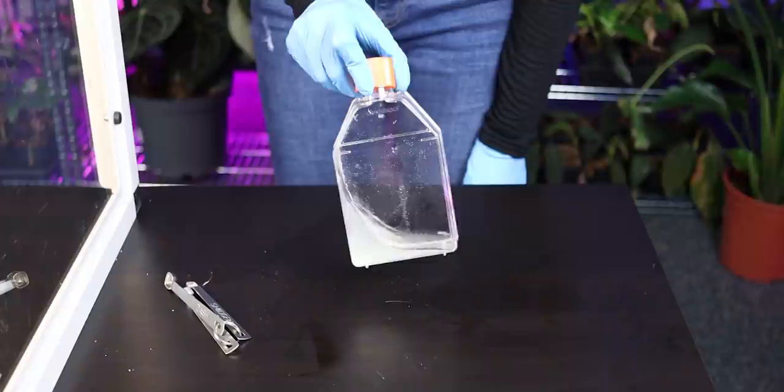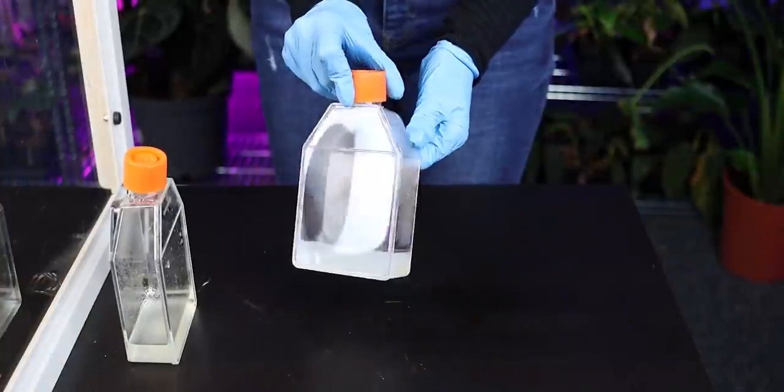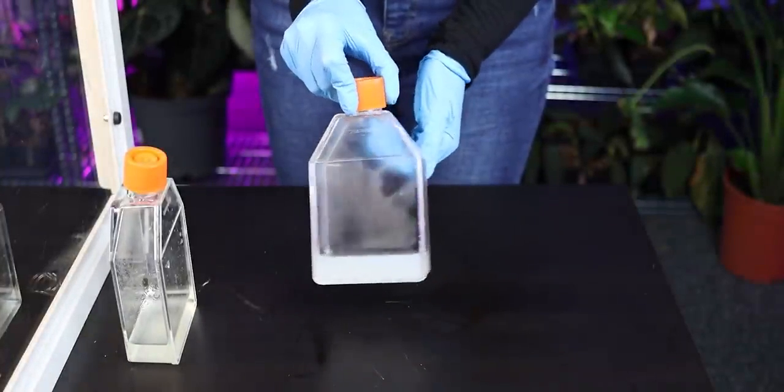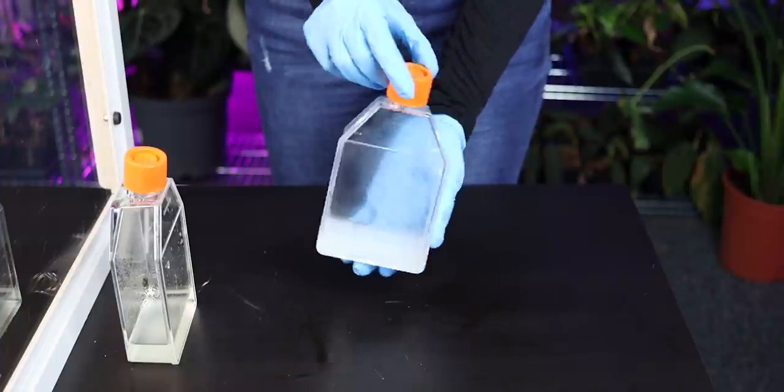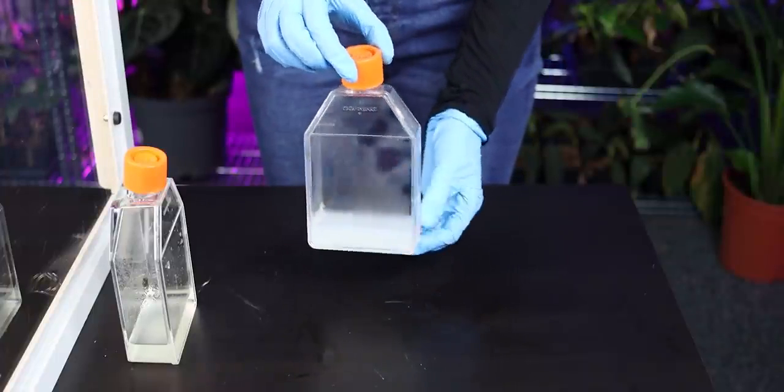After giving this solution a little bit of a shake, I'm going to boil this solution in the microwave. Now, in laboratory conditions, this would likely be done in an autoclave. However, this is kitchen culture and I don't have an autoclave, so a microwave is just going to have to do. Normally, of course, I would allow this mixture to cool and solidify on its own, but for now, we're gonna have to go with a little bit of a here's one I made earlier moment. So, here's one I made earlier.